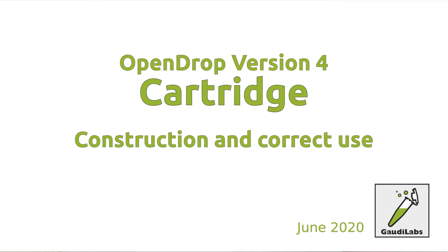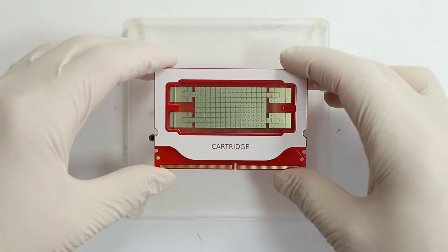Welcome to Gaudi Labs. Today I want to show you the new cartridge for OpenDrop version 4 and its correct use.